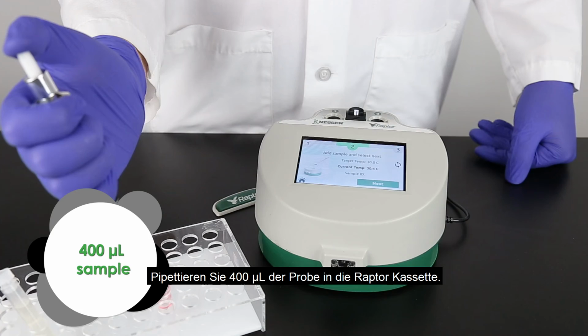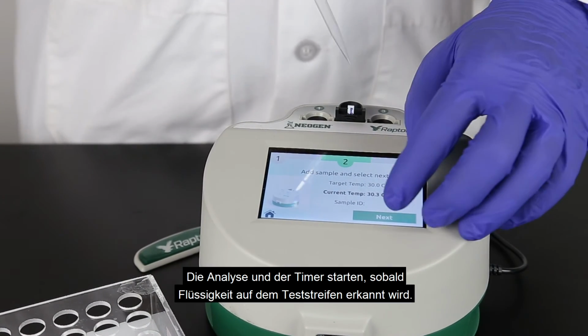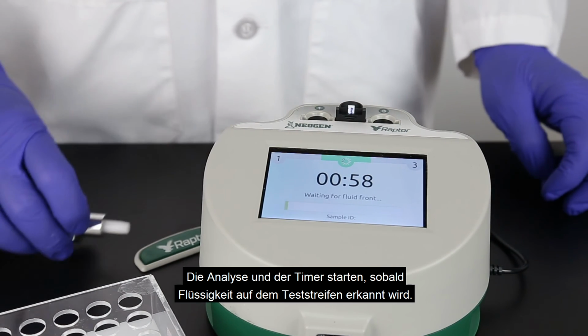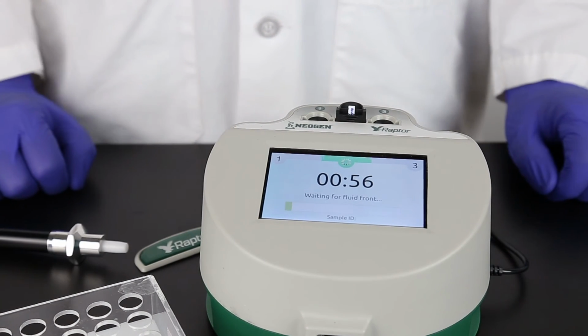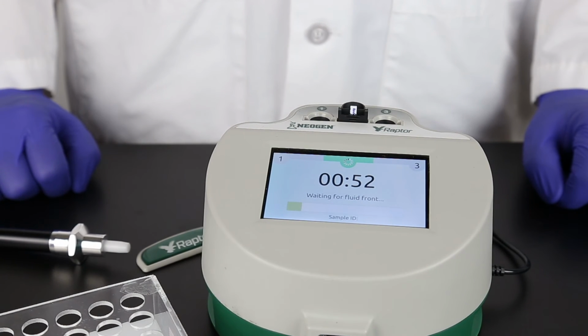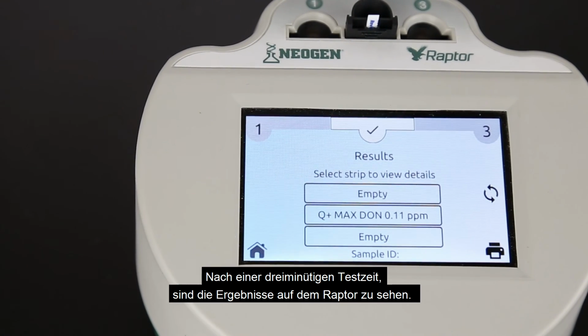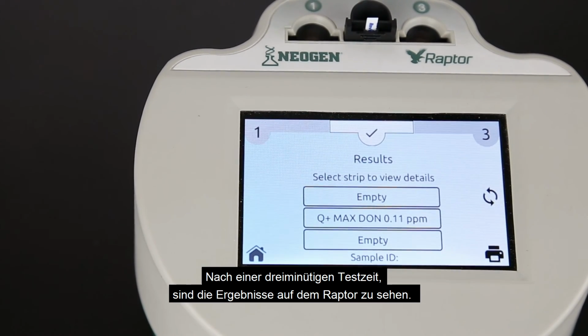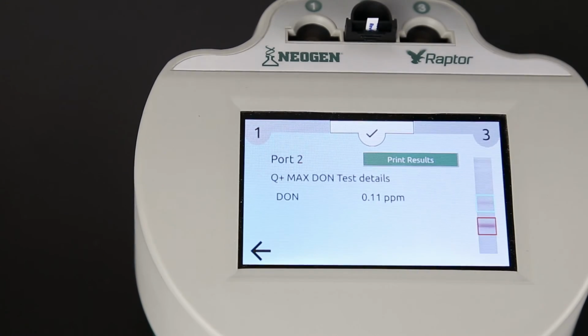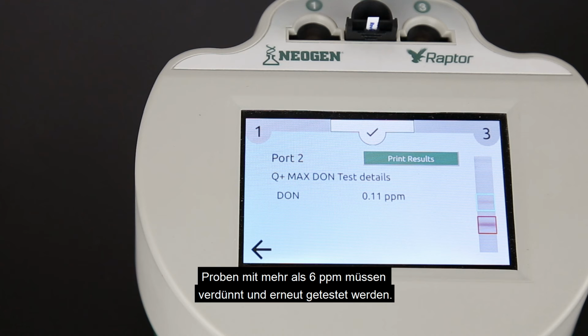Pipette 400 microliters of sample into the Raptor cartridge. The system and timer will start as soon as it detects the fluid front on the sample strip. You can now start samples in the other 2 ports on the Raptor. Each port operates independently. After the 3-minute testing time, the Raptor displays your results. For samples greater than 6 ppm, you will need to dilute and retest.